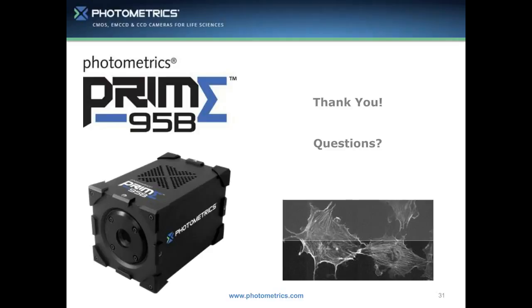While we haven't run the camera through deconvolution yet, the better the data going in is typically the better data coming out. And so I would expect deconvolution of image stacks with the 95B to be of very, very good and very high quality. You don't have the variation and excess noise that you would have with EMCCDs, and you have the same level of performance that you're getting with current front illuminated sensors in terms of noise, which have been used for deconvolution. So I would think that your results would be quite good.